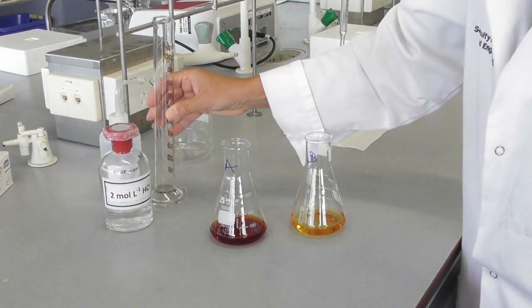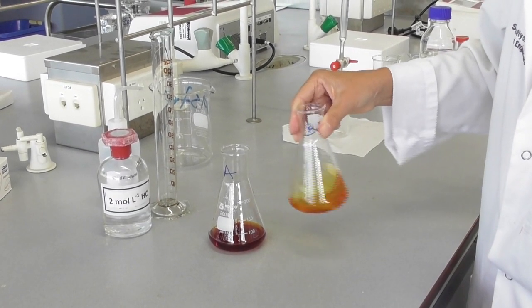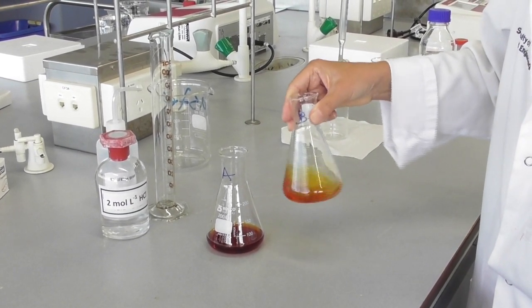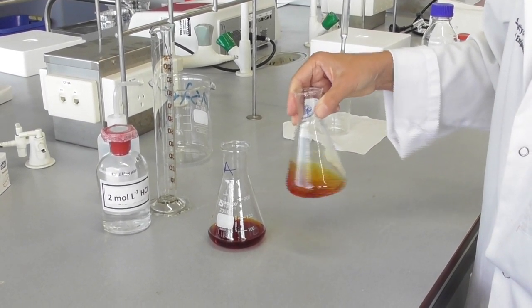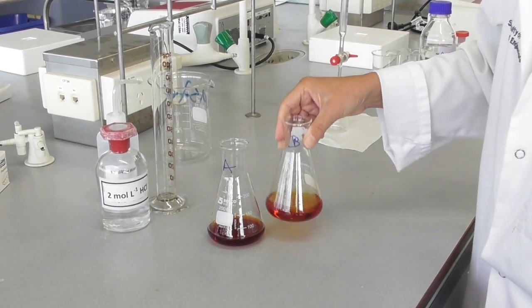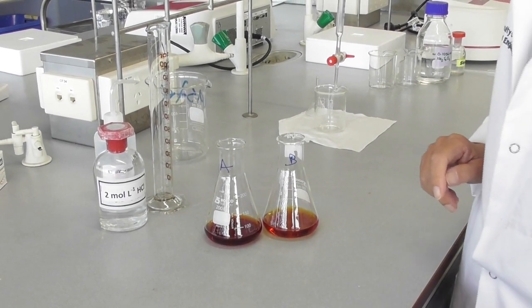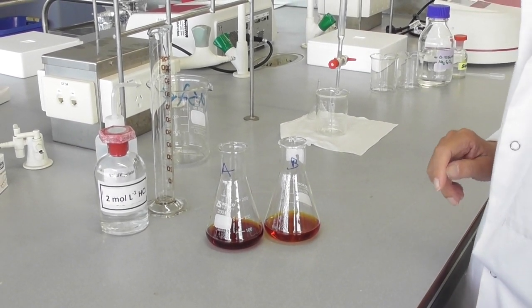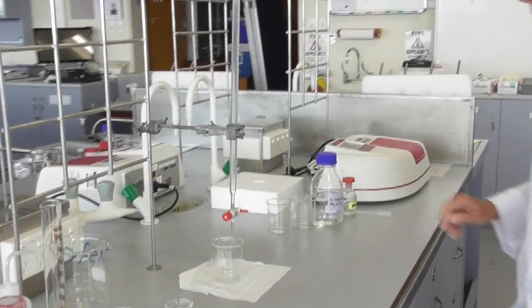Initially the solution turns yellow but then darkens to orange or brown. If it doesn't go dark I've made a mistake adding my reagents and have to start over. To make sure all the potassium iodide reacts with the peroxyborate, I need to let this sit for about two minutes before starting my titration.